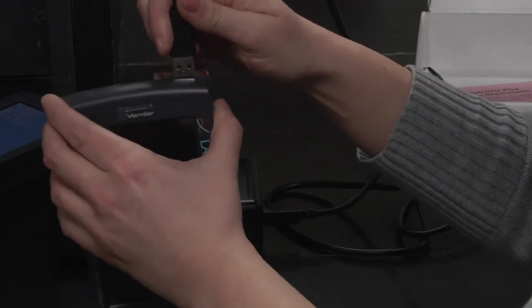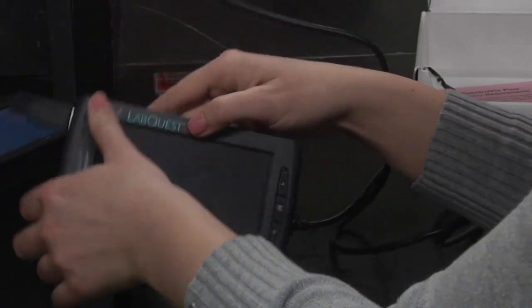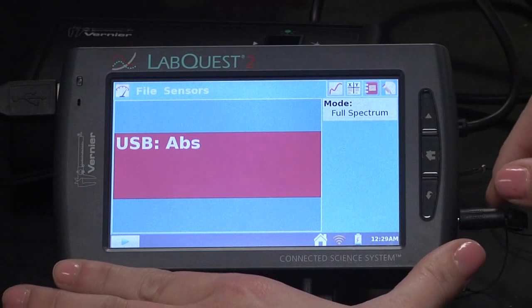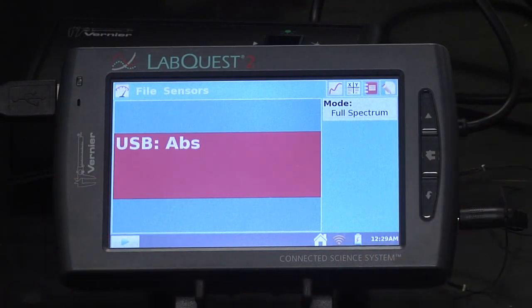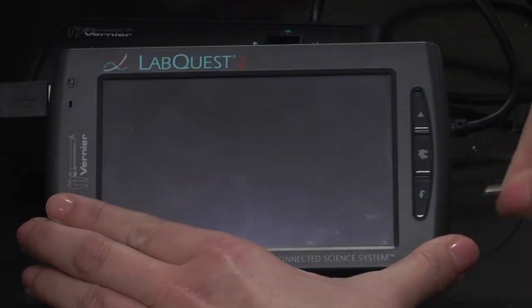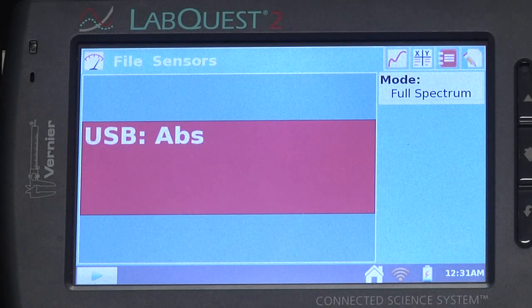There's a USB port right here and you want to plug it in. You want to make sure your LabQuest is plugged into an electrical outlet, and this is the port for that.